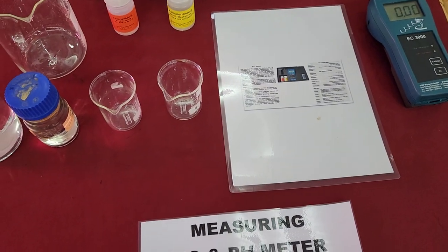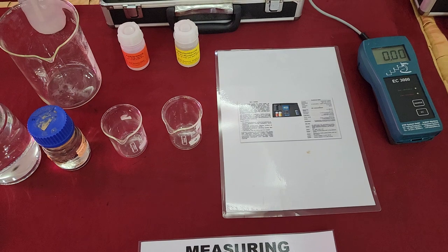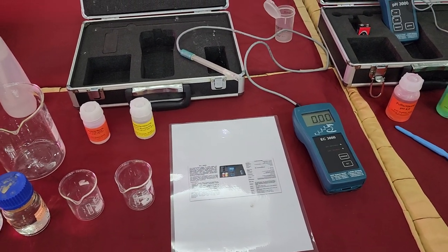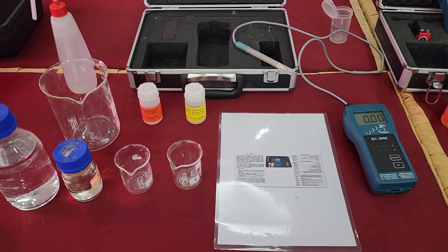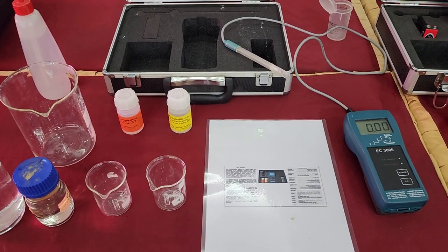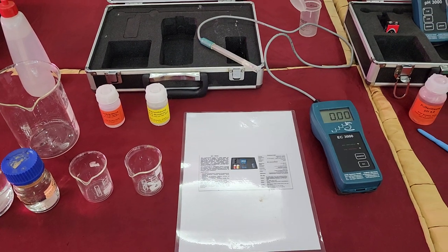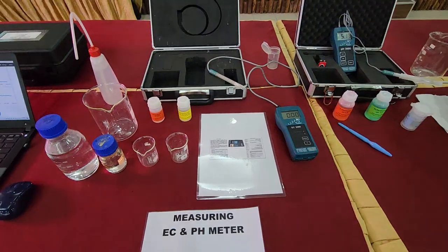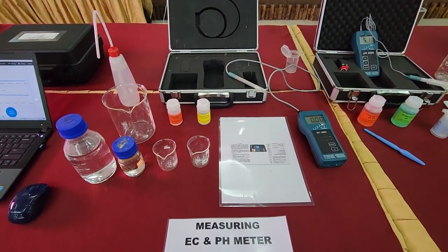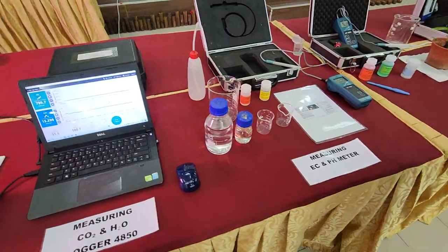So these two, we have an EC and a pH meter. What is EC? EC stands for electrical conductivity. What is it used for?